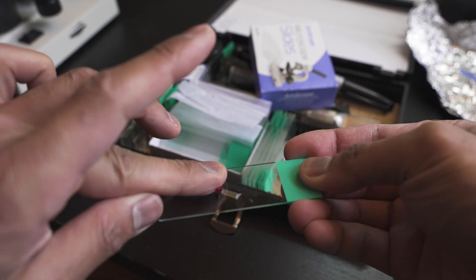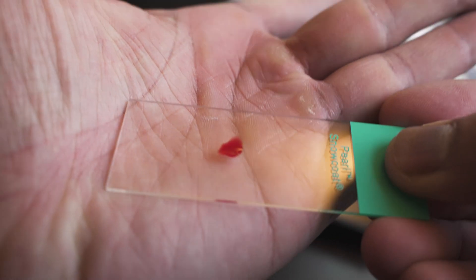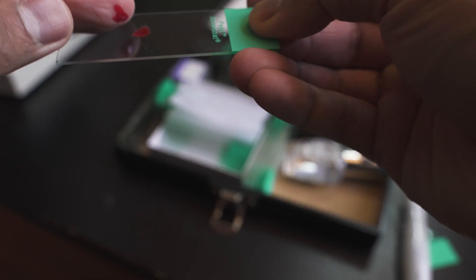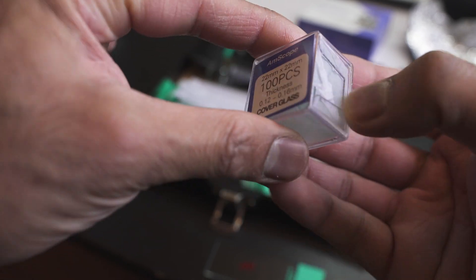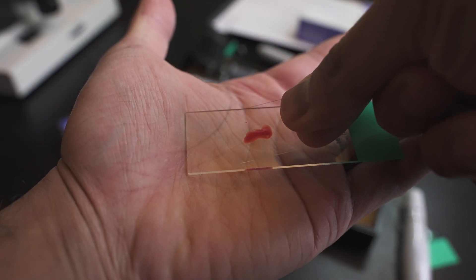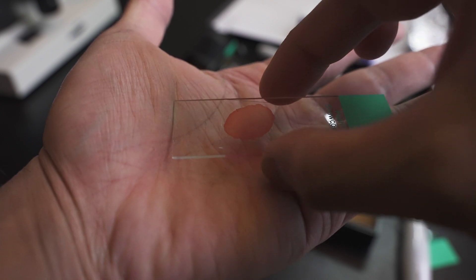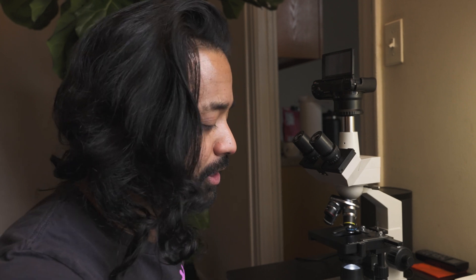Now we're gonna get some glass slides and put some of the blood sample onto the slide like so. Make sure all the blood is there, and then we want to cover it up with this cover glass slide. We're gonna drop it slowly onto the surface.